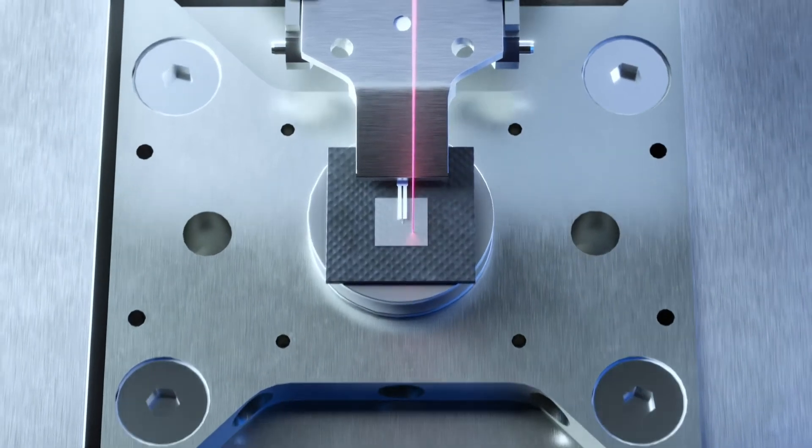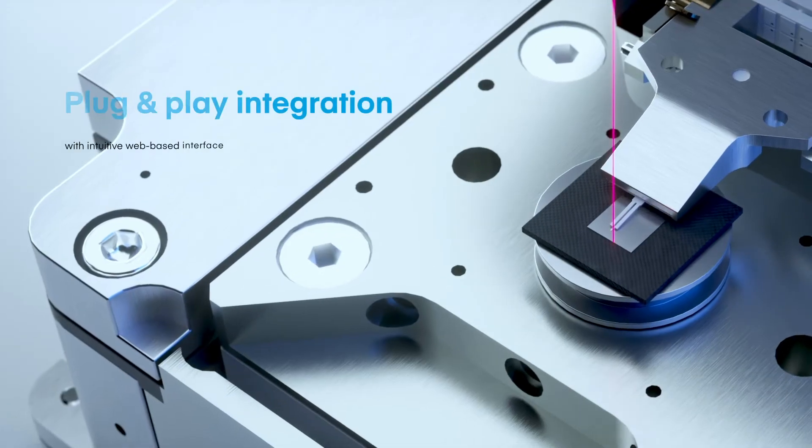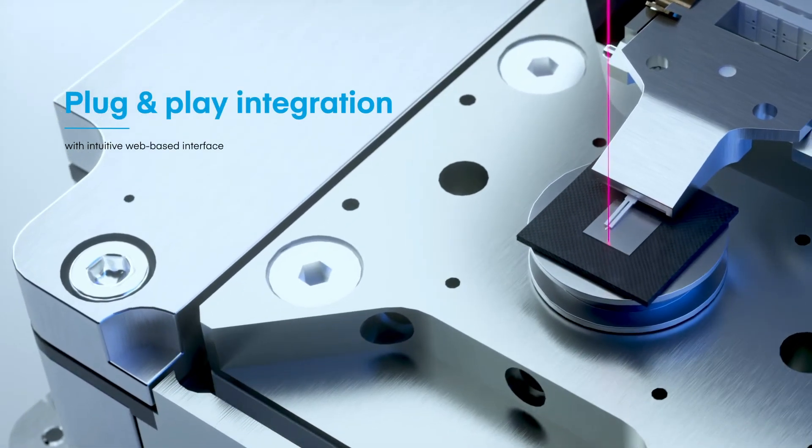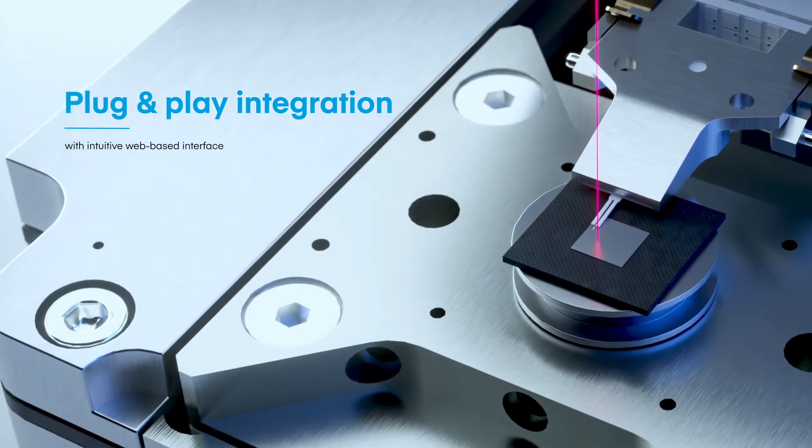LightScope incorporates a unique imaging technique called correlative probe and electron microscopy, shortly CPEM, enabling simultaneous acquisition of AFM and SEM data.